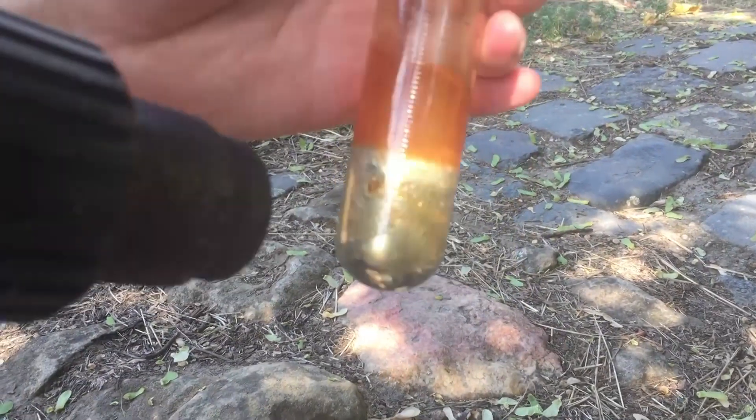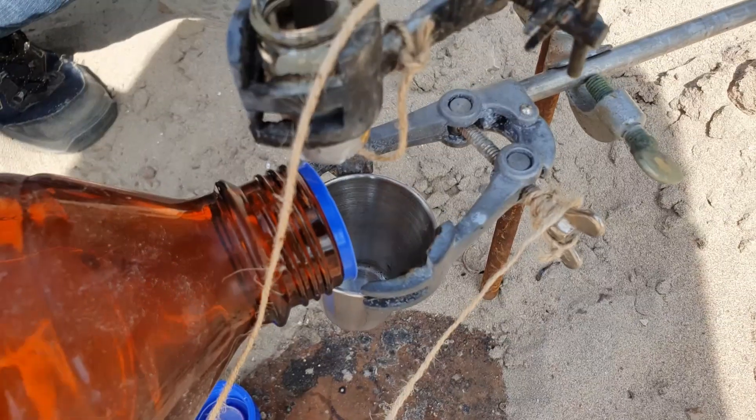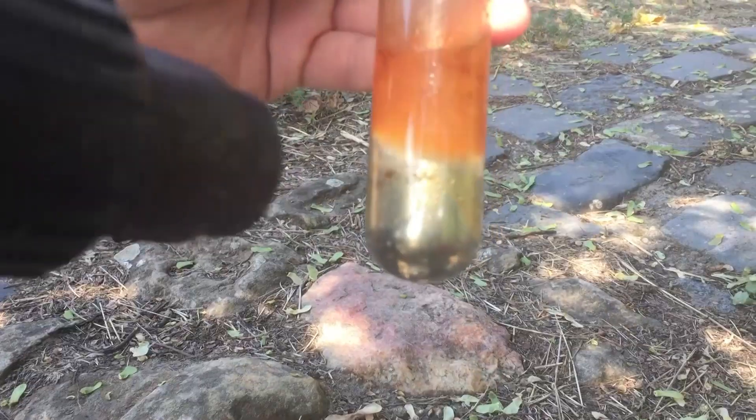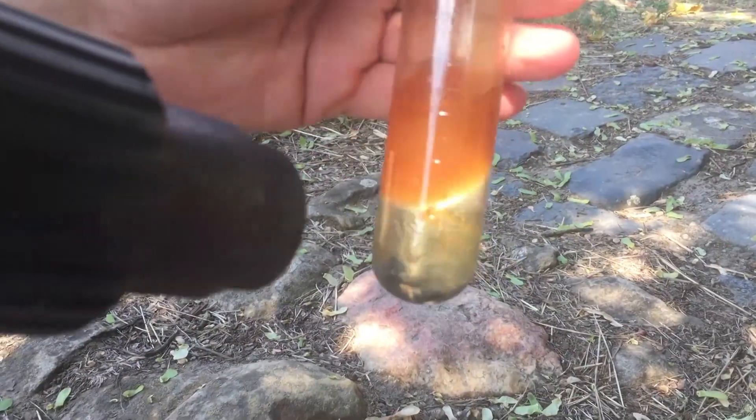Hello, today you are going to see what happens when you mix a highly explosive metal with a super toxic and carcinogenic liquid like chloroform. The metal we are using is the most explosive metal in the world, which is called cesium.